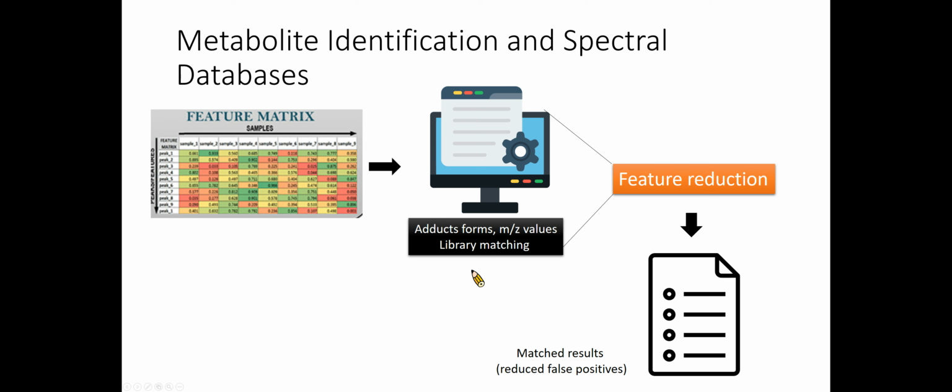Metabolite identification is one of the major challenges of high-throughput metabolomic analysis. In mass-based studies, the common metabolite identification approach is based on querying metabolomics databases for the neutral molecular mass values of the identified peaks using a tolerance window.